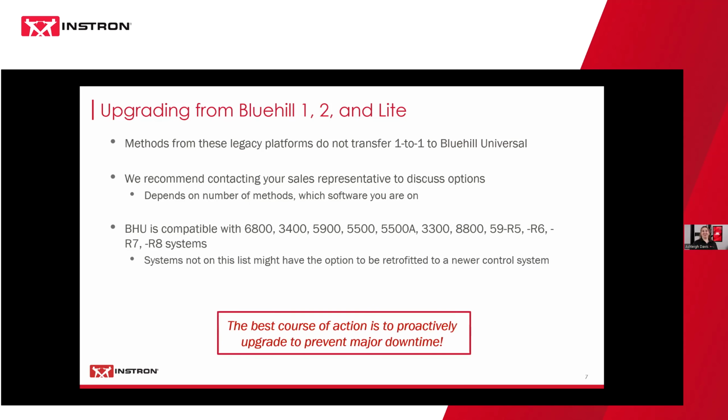And just as a reminder, the best course of action for your lab is to proactively upgrade in order to prevent major downtime. If you do have a lot of methods, you want to get ahead of it and think about how they're going to be converted, rather than have a full-blown crash and having to get everything up and running quickly. So it's a lot of stress.